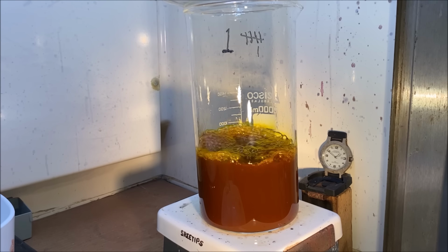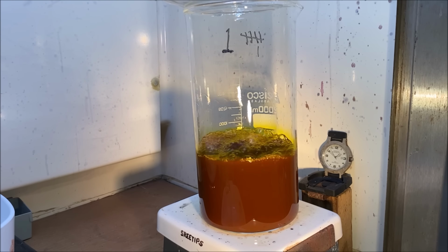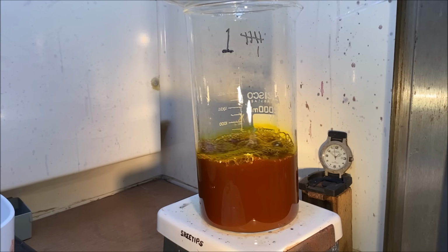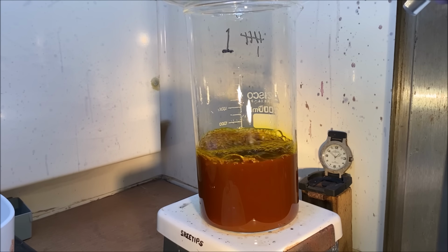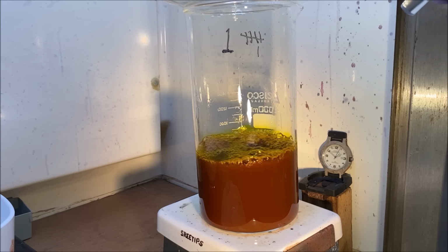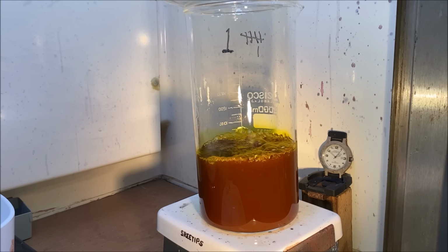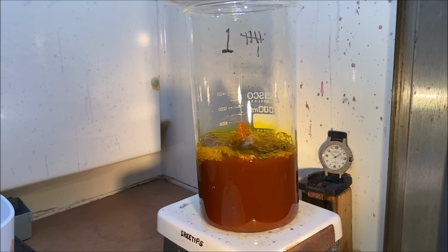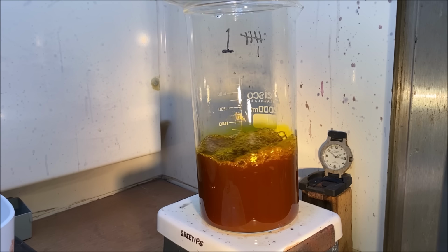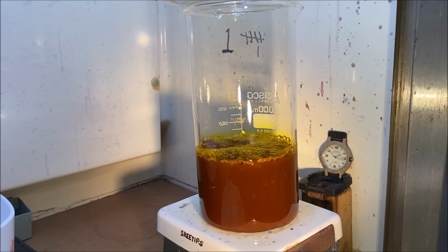We've got this thing on a rolling boil. I'm not quite sure what we've got going on here. I'm going to add a few drops of nitric acid, just one drop at a time. This is real hot. That was 2 drops of nitric, and I don't see any reaction. So I think we got all the gold to go in solution.